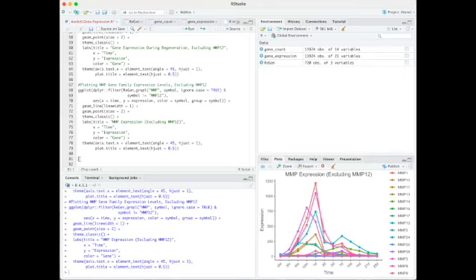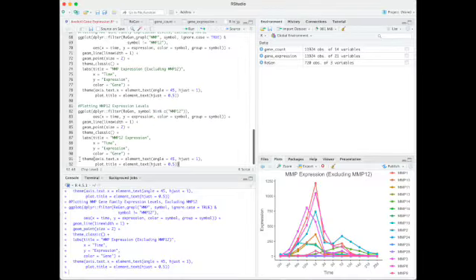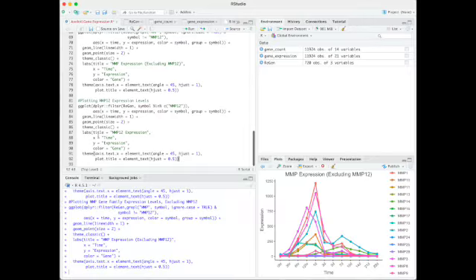Because of its high levels, it is disproportionate to graph with the other genes involved. So we will plot MMP12 by itself, while using dplyr filter to filter in Regen with Symbol %in% to identify the value MMP12, confirm its presence, and then plot it by itself.